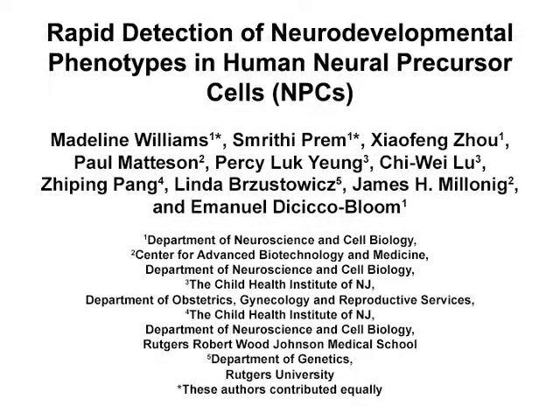The overall goal of this protocol is to characterize early brain developmental processes of human neural precursor cells in a rapid and reproducible fashion, and to define the effects of important extracellular factors in regulating these processes. This method can help address important questions in the fields of neuropsychiatry and neurodevelopmental disorders, such as, do all affected individuals have the same cellular abnormality, or alternatively, does each display a person-specific dysfunction?